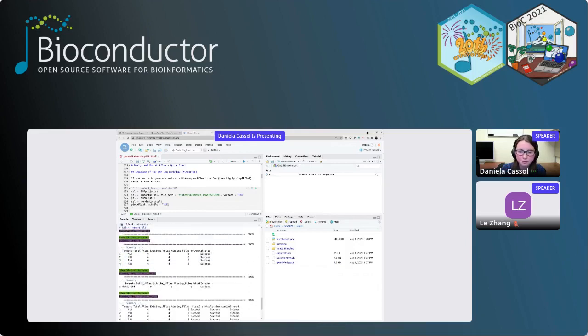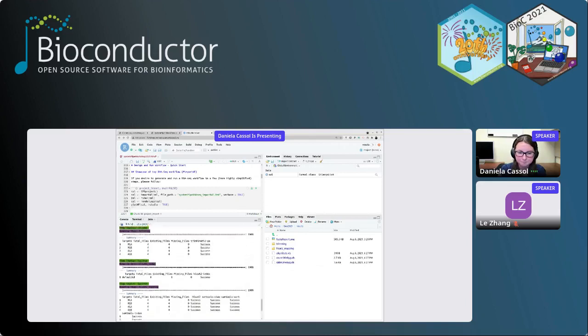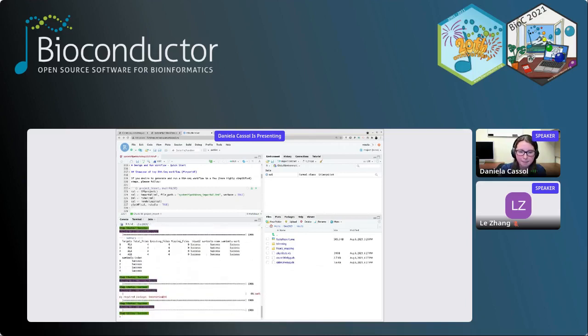So if, for instance, we have a warning here, the general status will be a warning because something was wrong there. And in the case of the mapping, we also have that status. We have a sum of the files, but for each one of those steps we also have the status. And down here was the R step. In that case, we don't have the summary. We just have the status, the progress bar, and then the final status here.